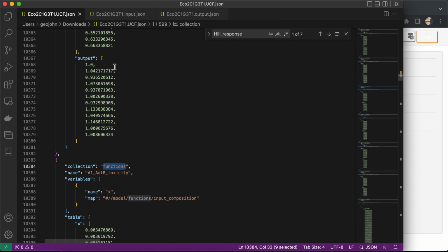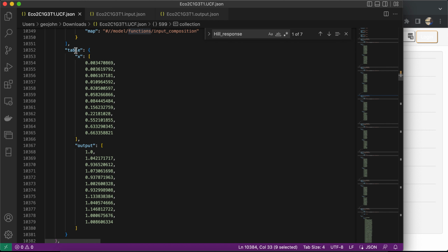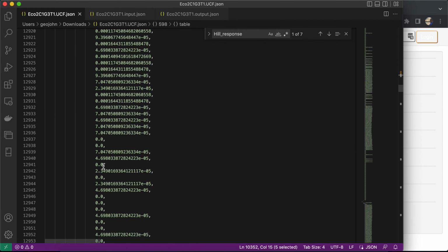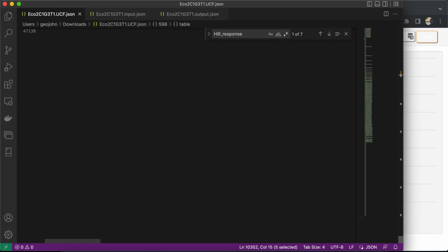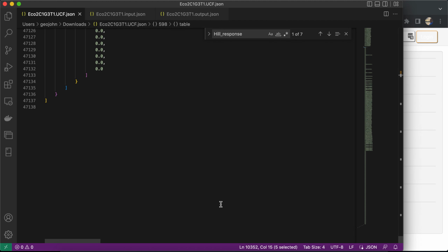This is where, like I previously said, you're going to have to run these experiments yourself and get the results for this table and what the output would be. All of this for the rest of this document is toxicity and cytometry. It's about 30,000 lines of it, where we were just up at 10,000. As I go to the bottom, we hit about 45,000, almost 50,000.